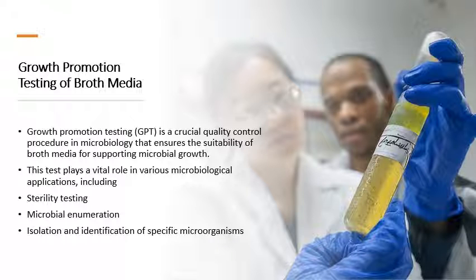Then for growth promotion testing of broth media, it involves a crucial quality control in microbiology that ensures the suitability of broth for supporting microbial growth. It provides sterility testing, microbial enumeration, and isolation and identification of specific microorganisms.